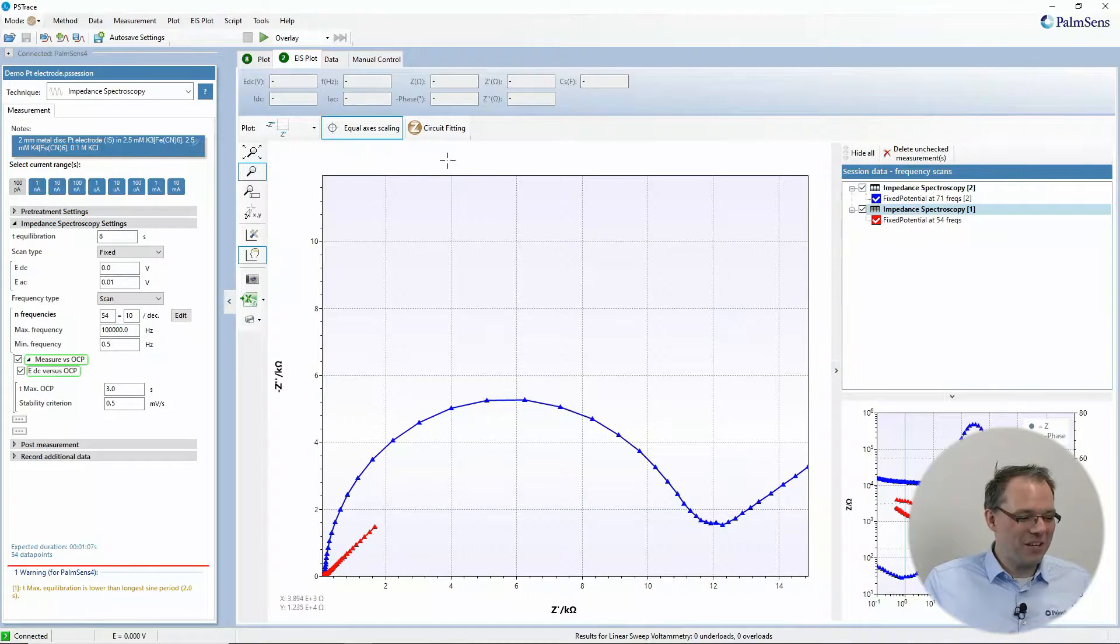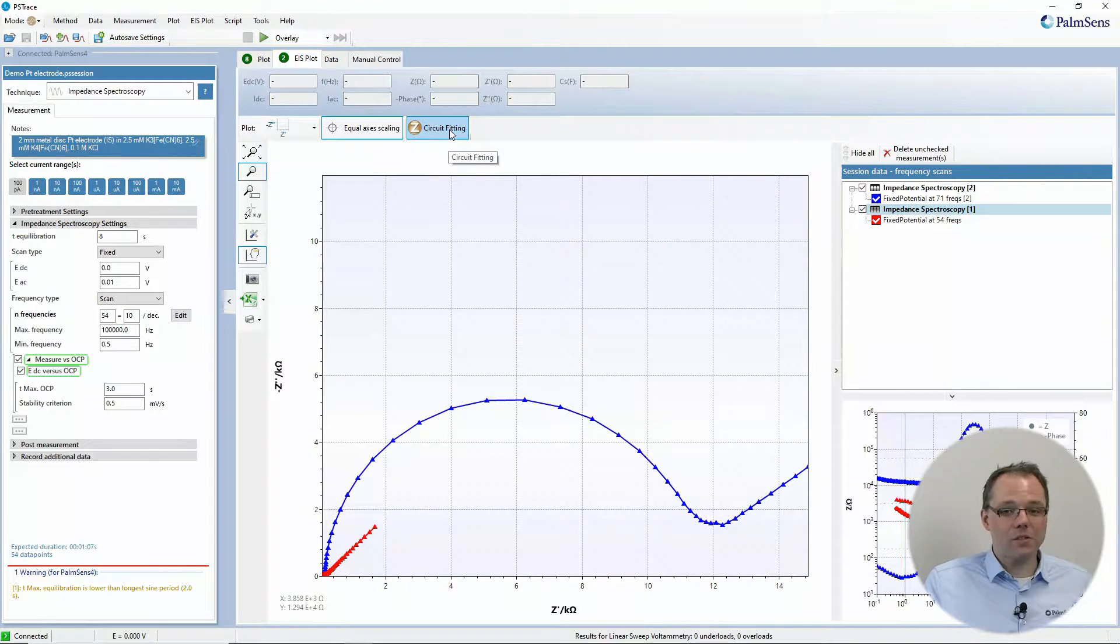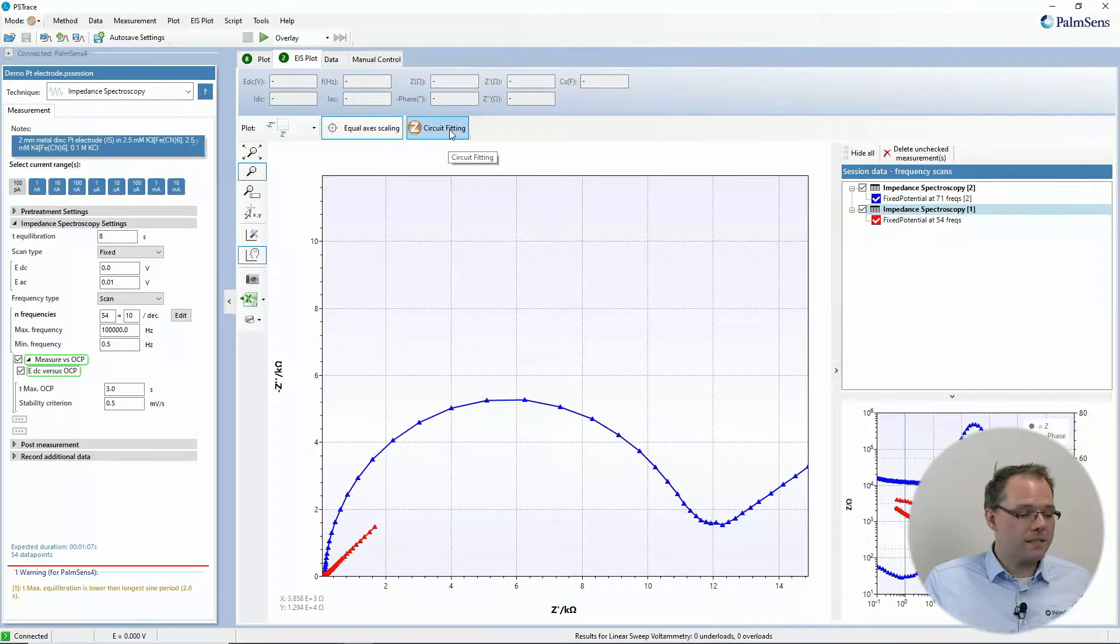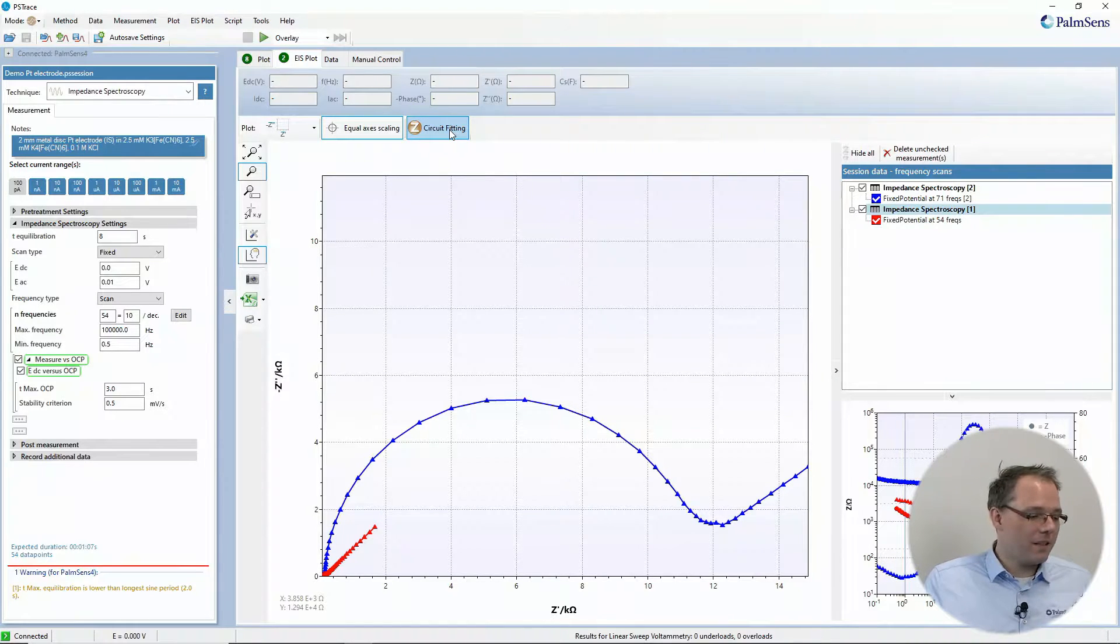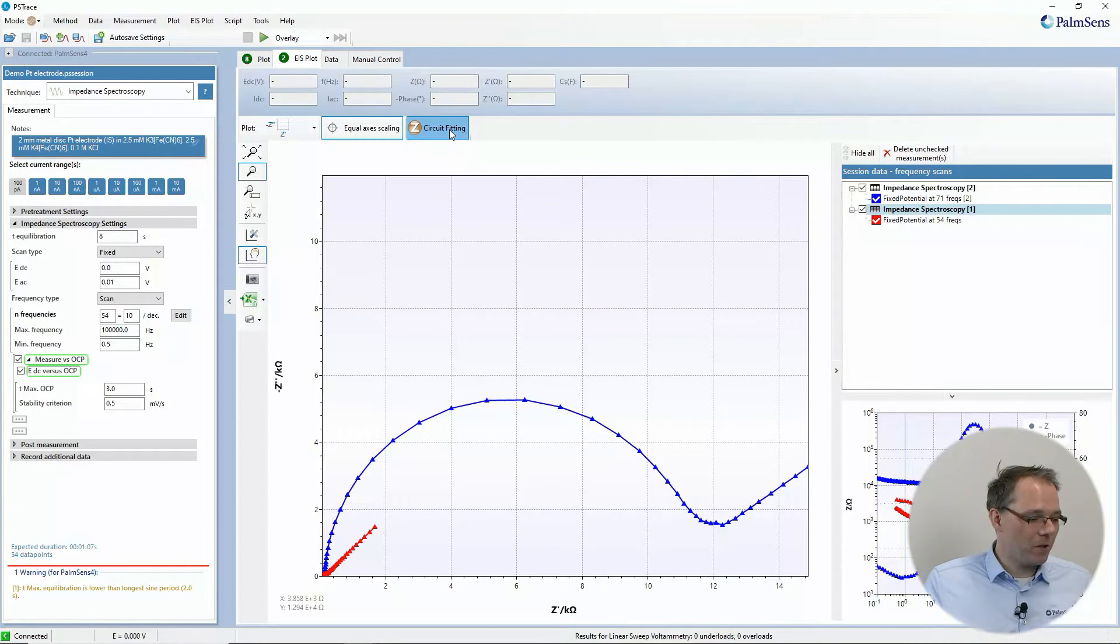First let's have a look where you can find equivalent circuit fitting, and that is behind this button in the impedance plot window.